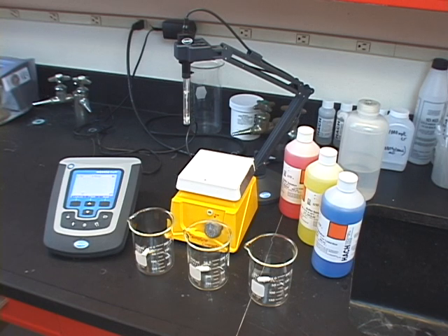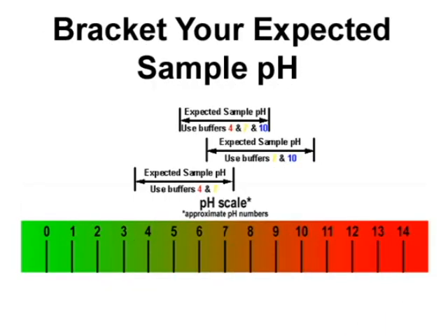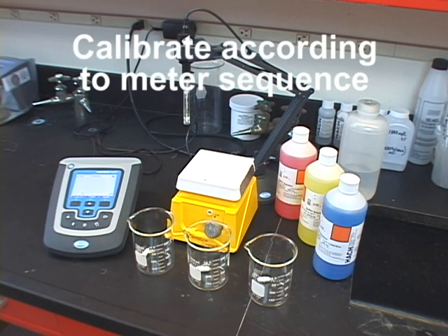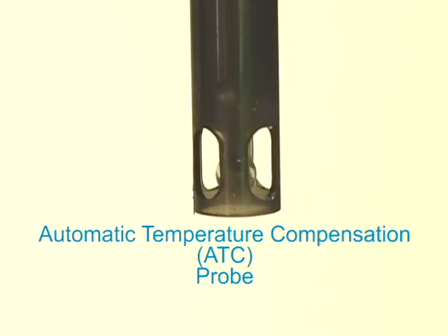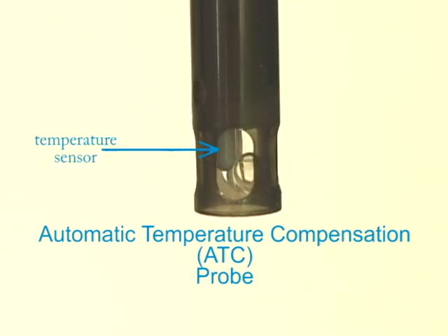Now let's discuss the importance of using the correct buffer values for your calibration. Ideally, you'll want your calibration points to bracket your expected sample pH. For example, if our expected sample pH is 8, then calibrating with the 7 and 10 buffer is sufficient. If we expect measurements to fall between 6 and 8, then you should consider a 3-point calibration using the 4, 7, and 10 buffers. Always calibrate in the sequence specified in your meter's user manual; if a buffer sequence is not stated, it's best to calibrate from the lowest pH to the highest. Remember, pH is temperature dependent. A simple way to address this is by using automatic temperature compensating, or ATC, probes, which will ensure that you have an accurate reading at any temperature.